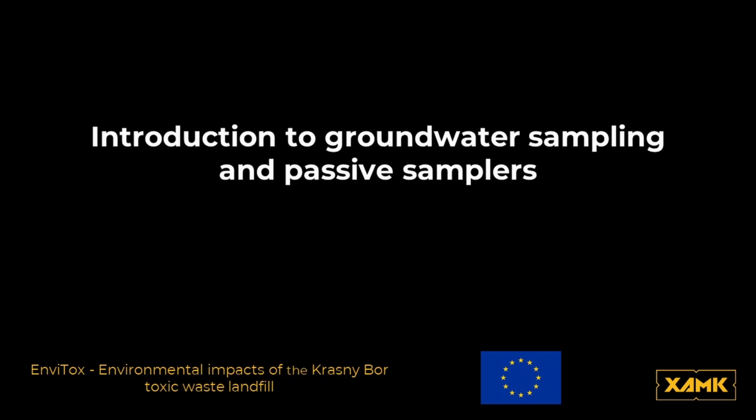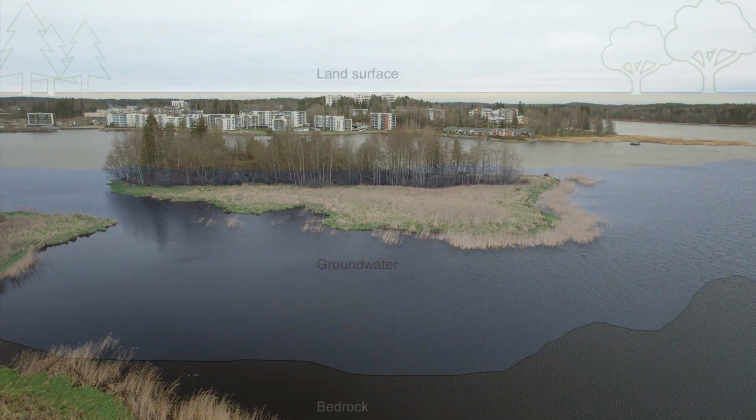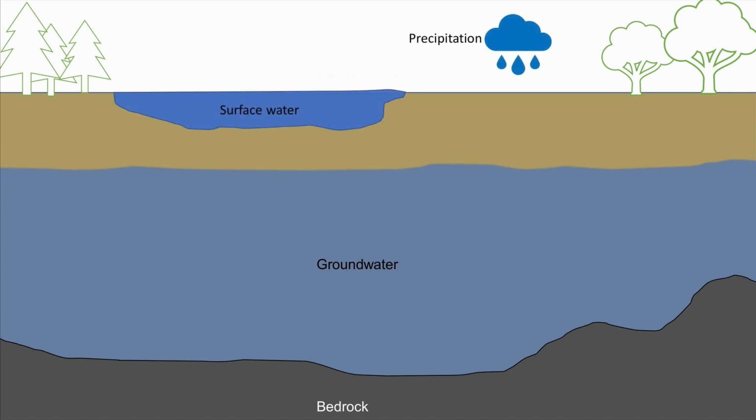This video talks about groundwater sampling in general and describes the operation of a passive sampler for groundwater. Groundwater means water that runs in the empty spaces within the soil and bedrock. It does not mean an underground lake, but water present in underground pores.